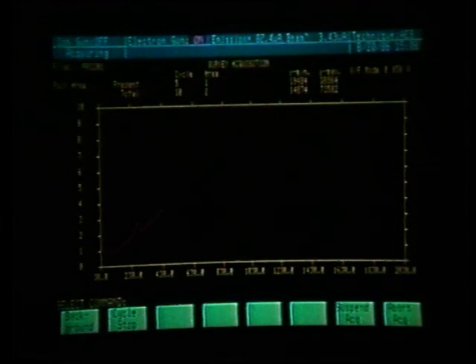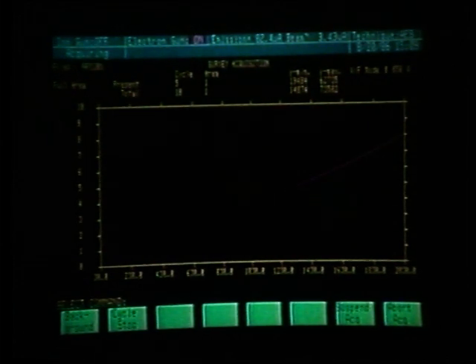If we are not sure of what that contaminant might be, what we can do is utilize the suspend profile routine and obtain a survey scan at that interface. If we suspect an element, we can set up for that element and monitor through the profile from the surface into the substrate and determine if at any time during the profile we were able to detect the presence of that element.